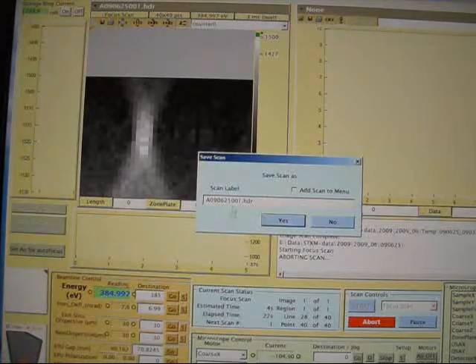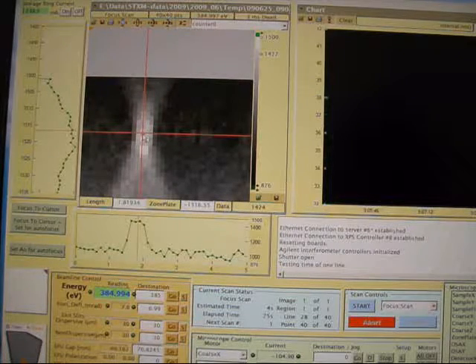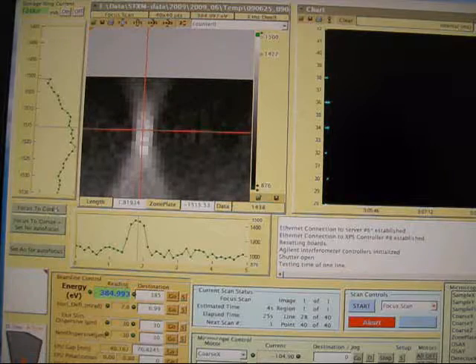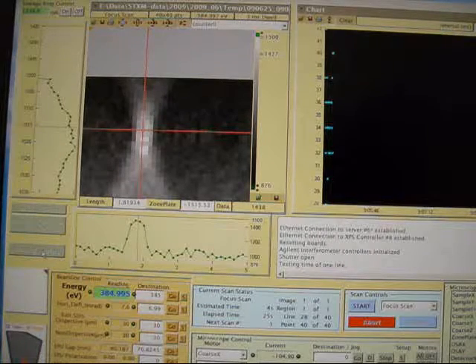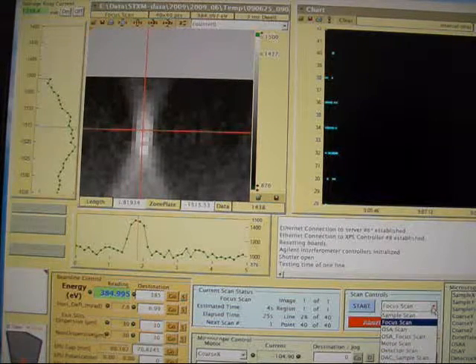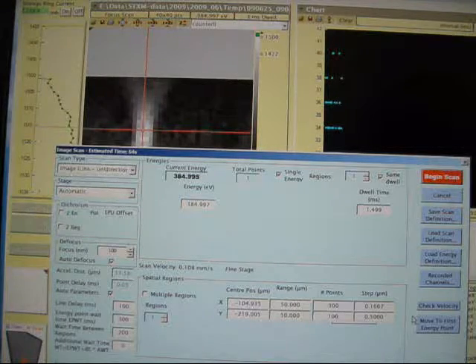After the focus point shows up, we abort the scan and click on it, and then we click focus to cursor as usual, but this time we click set to A0, and this will change A0 instead of zone plate. And then we do a scan. We should be able to get a perfect image.